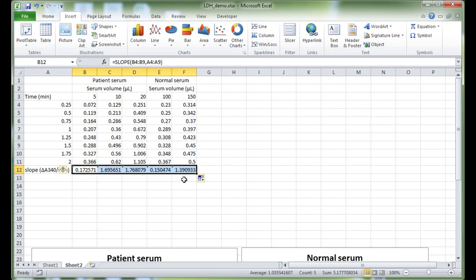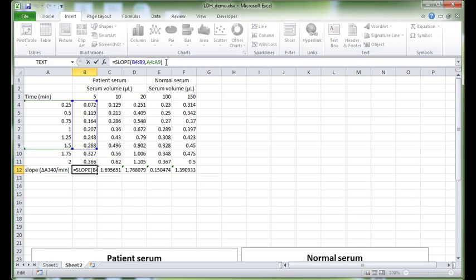If we have a look and go into the formula that we're using in Excel, we start with our B12 cell. We click on that, and to inspect this formula we can click up here in the formula bar. We can see that Excel is calculating, getting the y values from this blue square and the x values from this green square. So far so good.